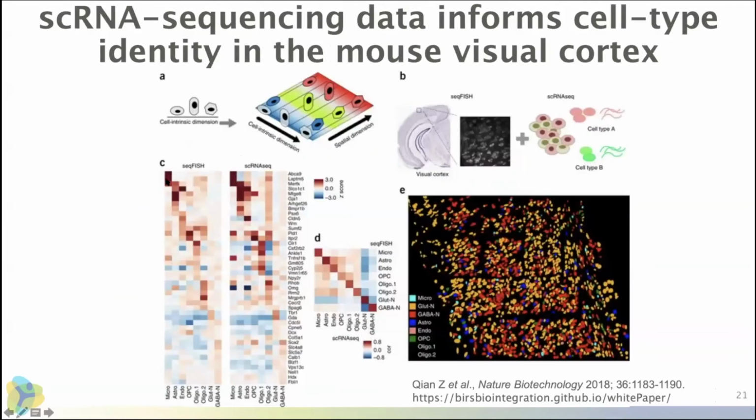So again, I want to share examples of projects that Proof or I have looked at as well. This study is looking at single cell RNA sequencing data, and also looking at the spatial coordinates of cells. As you can see from panel A here, what the study did was quantify the relative expressions of about 113 genes in different cells. This was done with the cells localized to their position on the tissue sample. So we're able to quantify the expression at the location of these single cells.